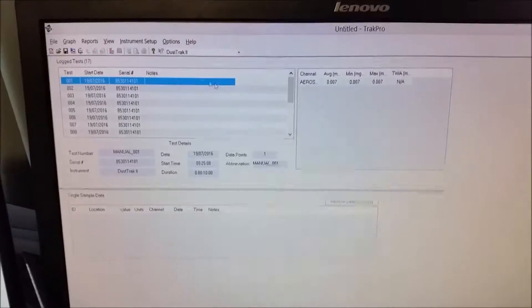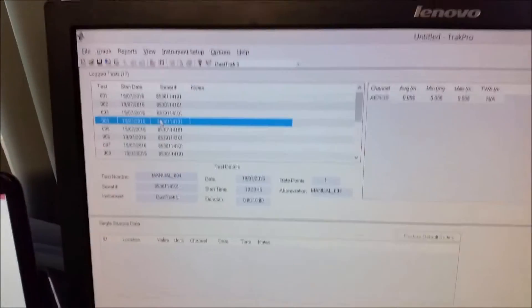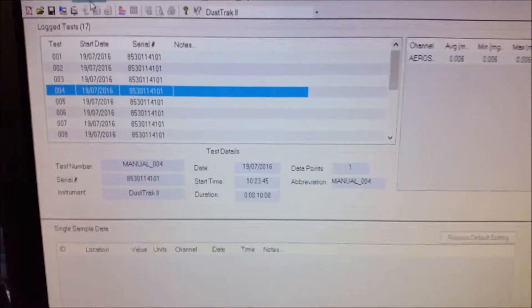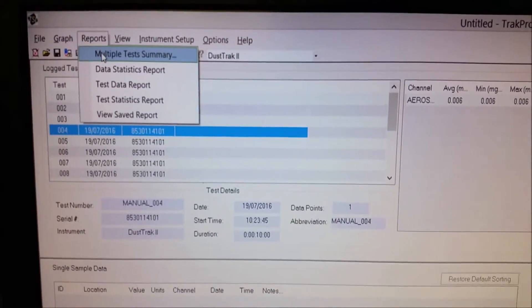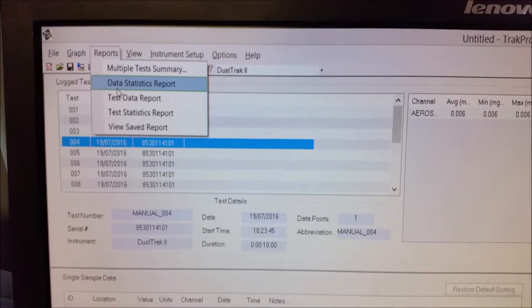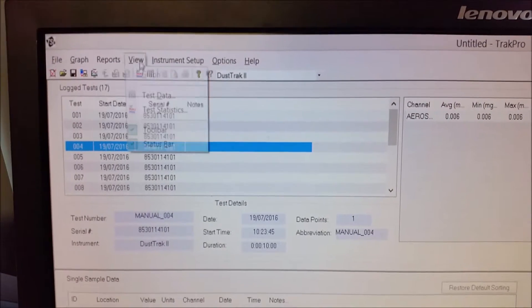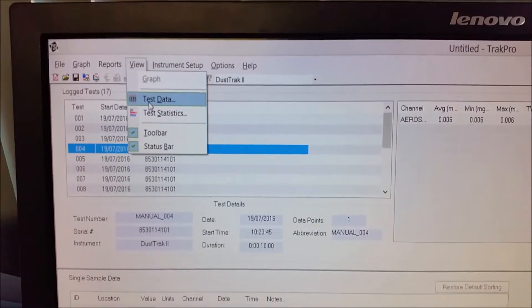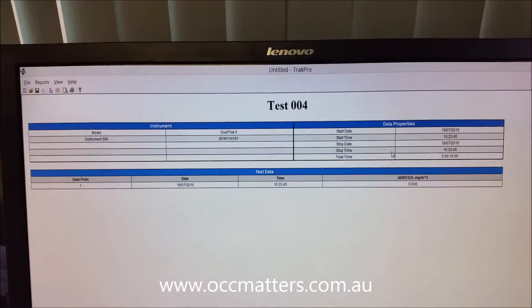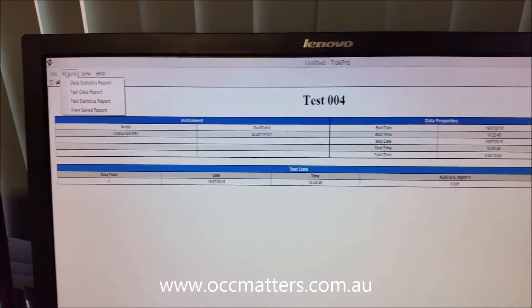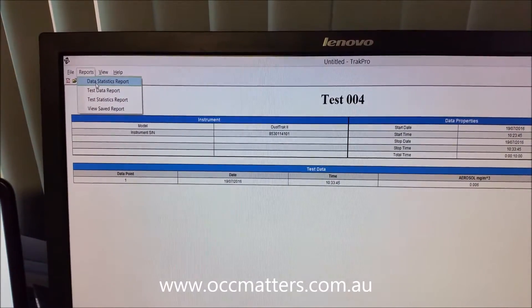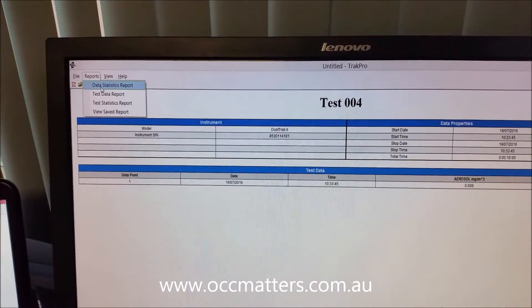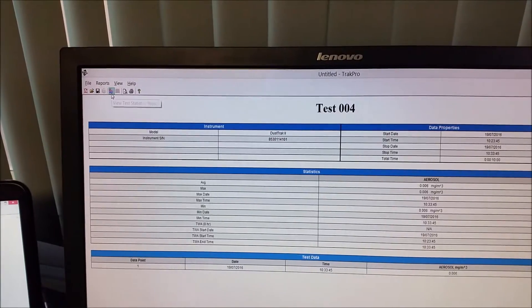You can do it one of two ways. You can do it singly. So, we've got 18 data files. We can go view test data, view data statistics report.